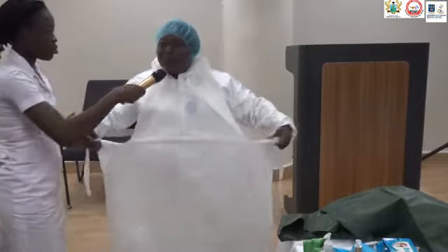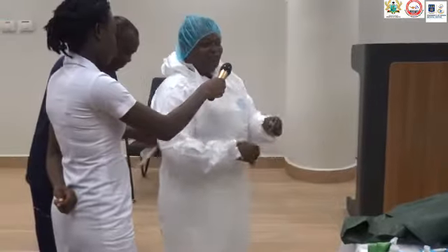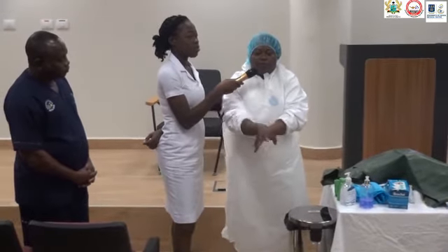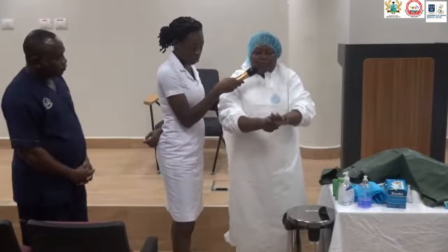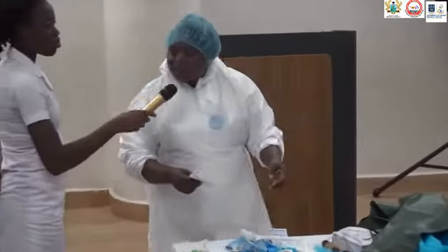Today I want my supervisor to tie it for me, although I can tie it myself. I'll pull this here, keeping my fingers again — palm to palm, interlacing, capping, cleaning my thumb, and then my wrist. In some cases you can wear an examination glove underneath and wear the surgical glove on top.